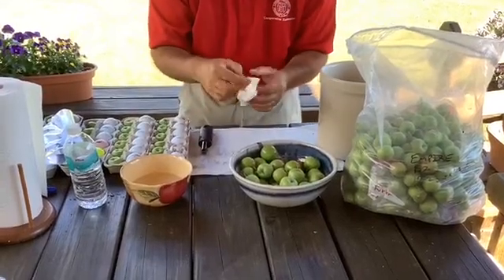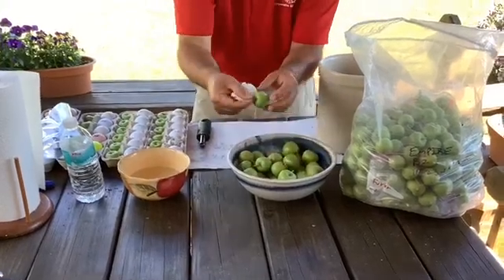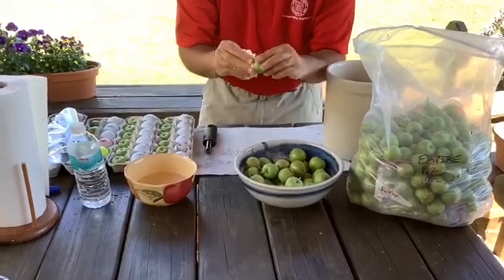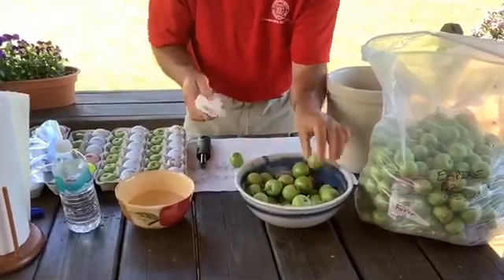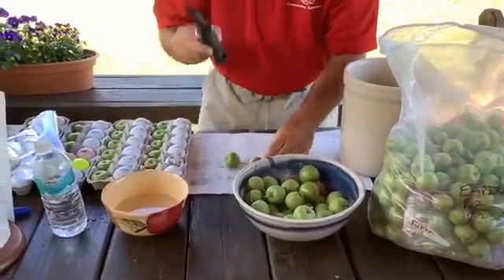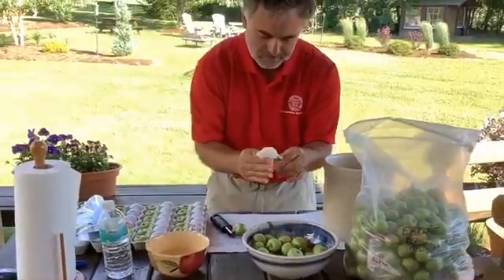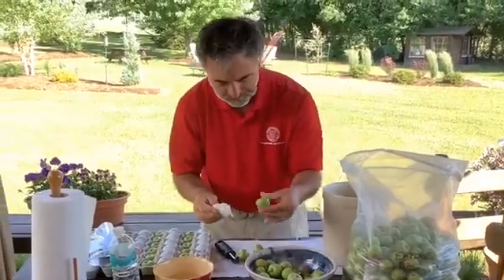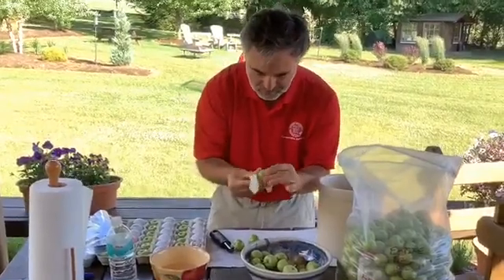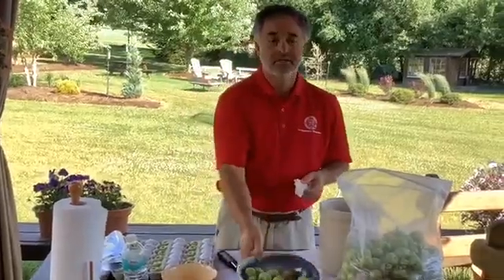You have a clean area in your kitchen or in any place, and you're gonna take one of the fruitlets, without the stem, or with the stem you take it out, and you clean very carefully the peel surface of these fruitlets that you have selected for the peeling with this tool. That is the next step that we're going to talk about. So you just make sure that you clean very well. You remove any residue. You let the fruitlet dry out a little bit here until you clean the 30 that you have selected from the orchard.